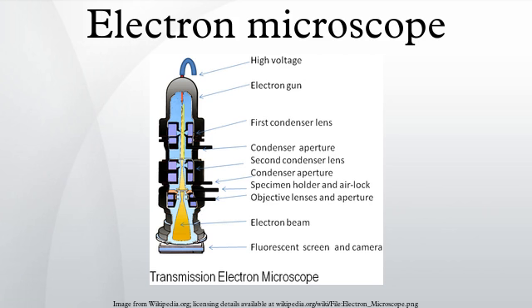When the electron beam interacts with the specimen, it loses energy by a variety of mechanisms. The lost energy is converted into alternative forms such as heat, emission of low-energy secondary electrons and high-energy backscattered electrons, light emission or X-ray emission, all of which provide signals carrying information about the properties of the specimen surface, such as its topography and composition.